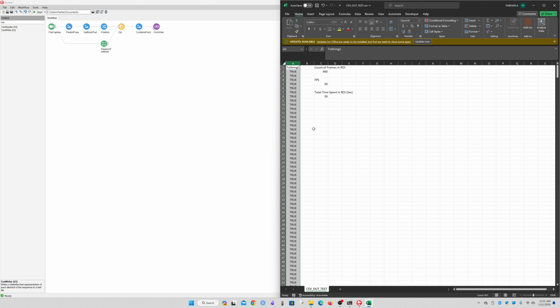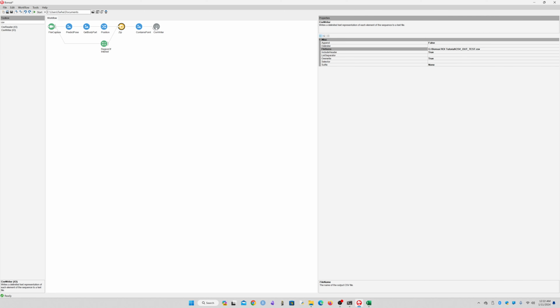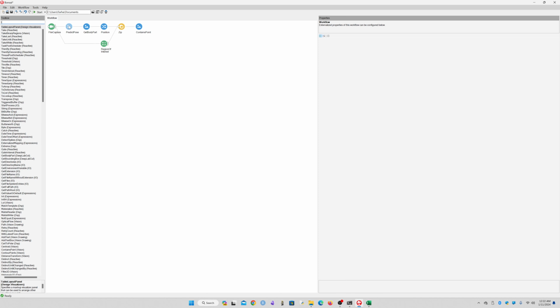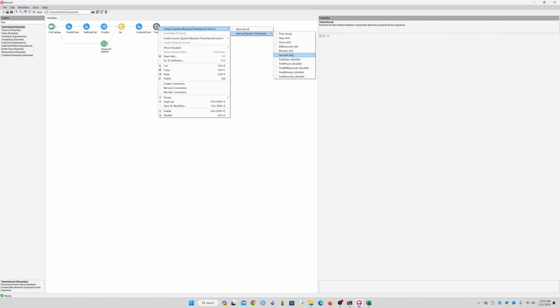And previously, as I was mentioning, you can also attach the time interval node, this one, to contain point, and then use the output interval and pick whether you want total seconds, total milliseconds, days and seconds, and so on and so forth, right?